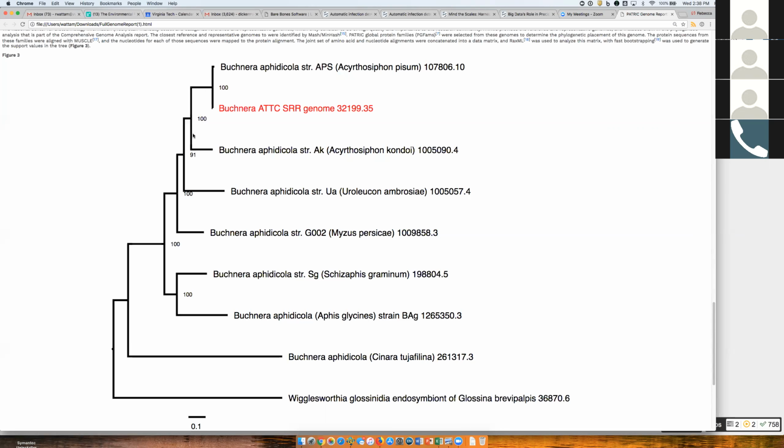And these are bootstrap numbers. We only do 5 because it's really fast. And we want to give you hints about where you should go next in your analysis. So that's the reason we do 5. But then what I would do is I'd go to our phylogenetic tree program that does hundreds of genes. It does a blast analysis to find 100 of the closest related genes. So that's what I would do if I were you, to look at that data.